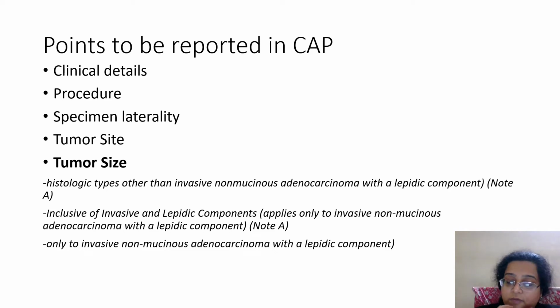In any large specimen, you have to check the weight. Then you have to describe the outer appearance, how it looks, and whether any extra stitches or surgical sutures are there, etc. All that you have to mention. In lungs, in cases where it comes as an autopsy specimen, you also have to check if there's a death by drowning. Then you float the entire lung or part of the lung in water and see whether it settles, sinks, or is floating. This is mostly done with pieces of lung.